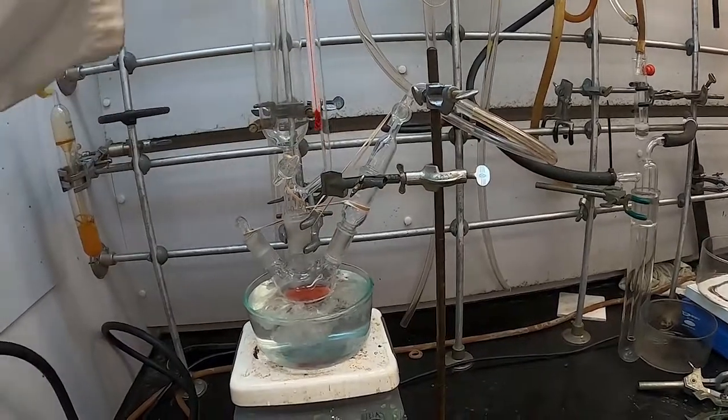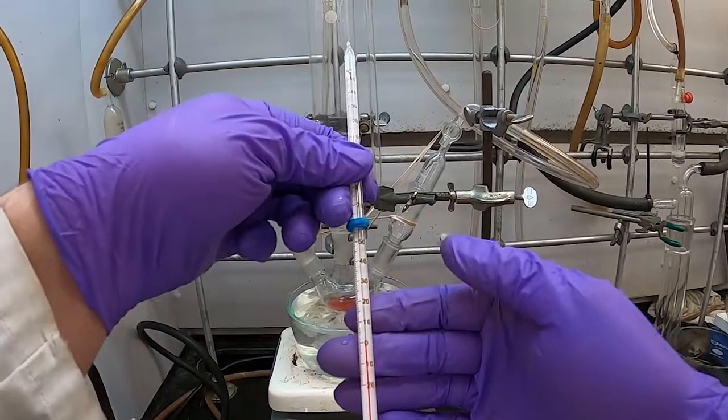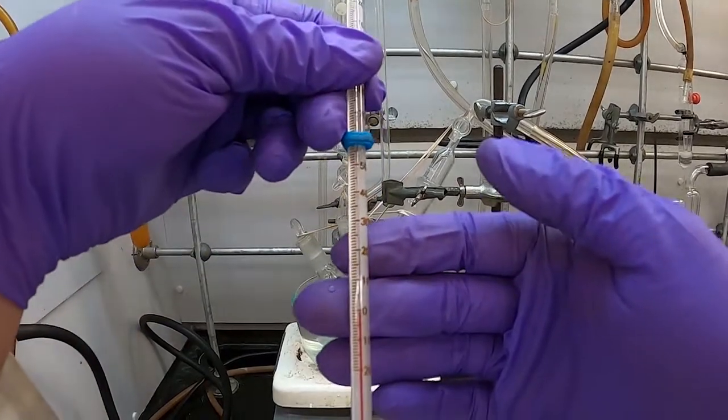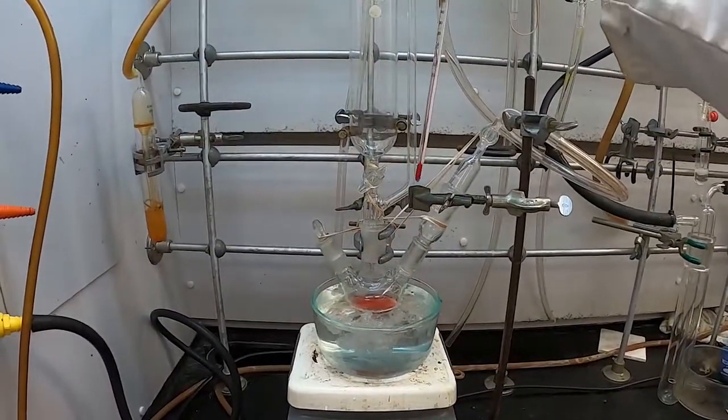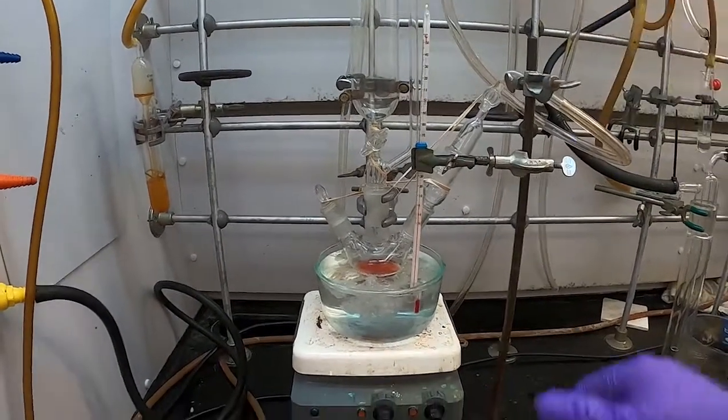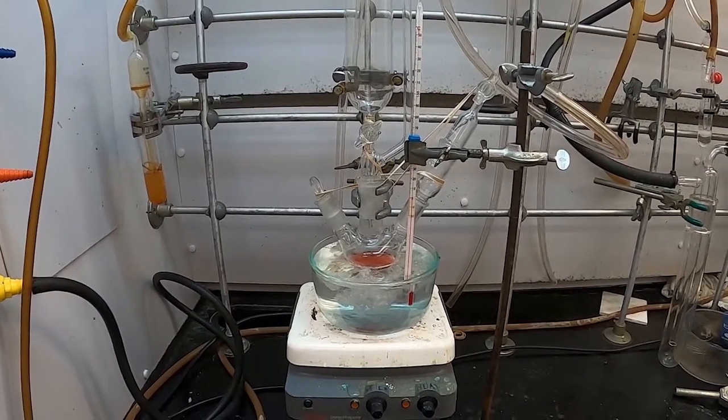So let's see. So there, just in that few seconds, that went from room temperature to just below zero. So the alcohol thermometers have a pretty good response time. Okay, we'll move on to other things.